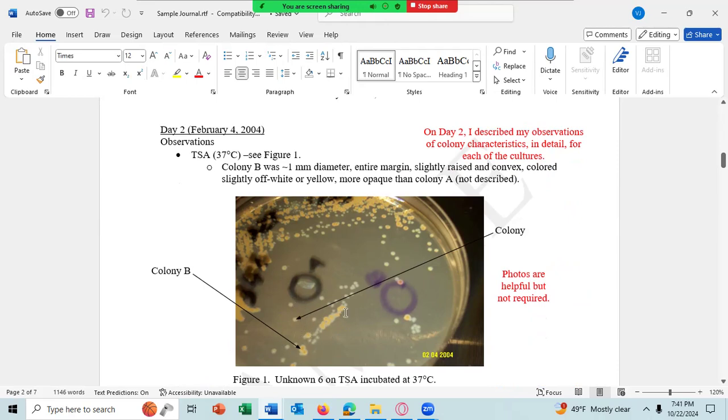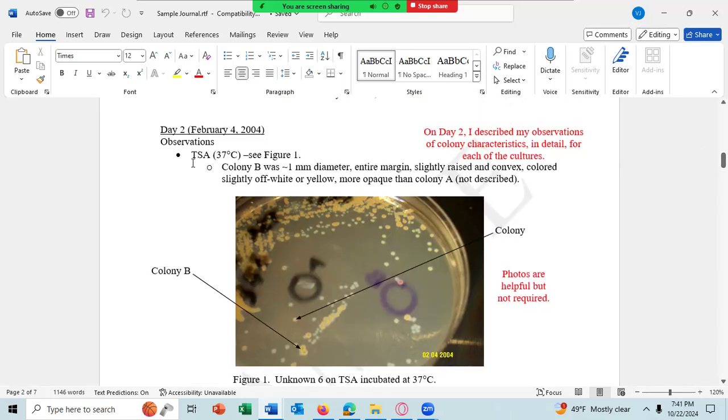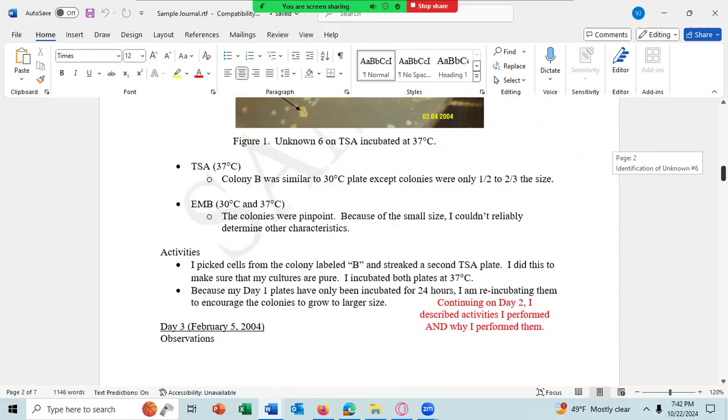You're going to be only given one number, which will represent one culture, meaning you're going to get a pure culture to begin with, but I do want you to pretend to streak it out and just write in your report, I got the unknown number, and I took the unknown culture and streaked it out on a TSA plate or a nutrient agar plate, streaked it out for isolated colonies, picked an isolated colony, streaked it out a second time, got isolated colonies, then took those cells from one colony to set up my stock culture. Ran other tests from that stock culture.